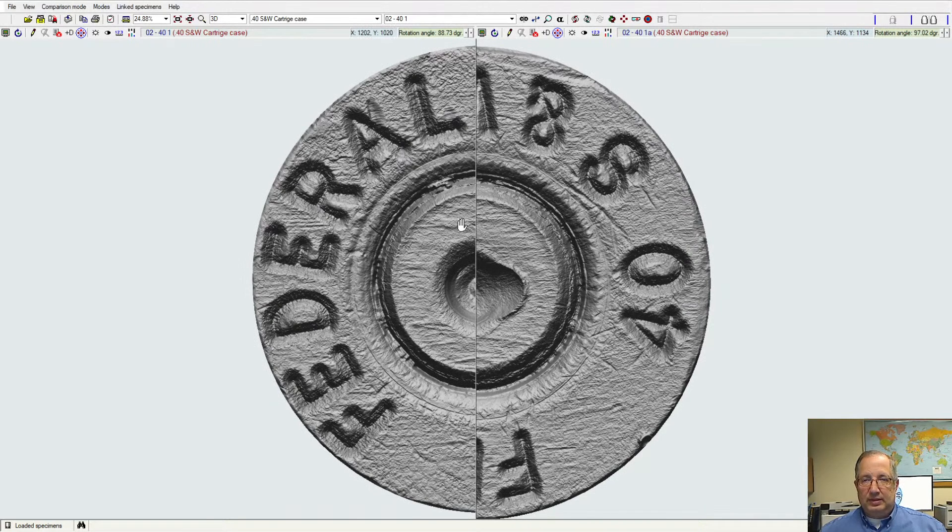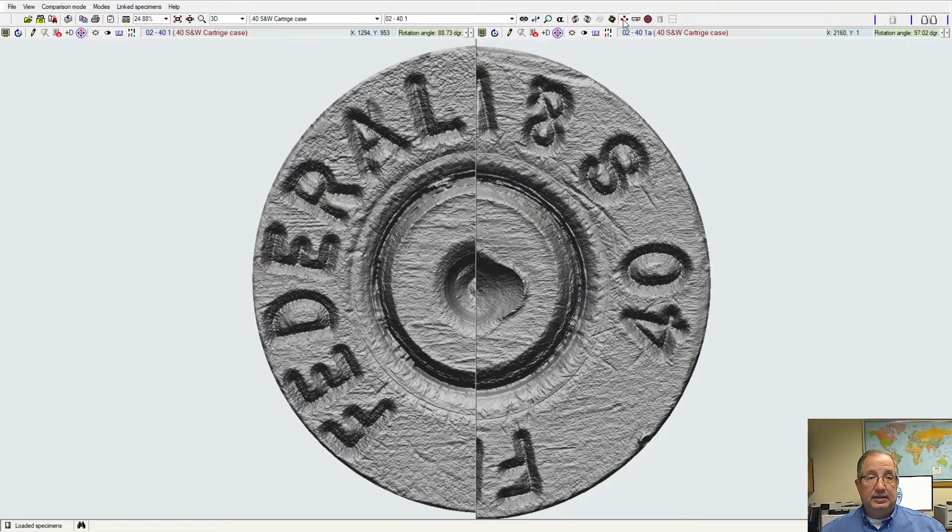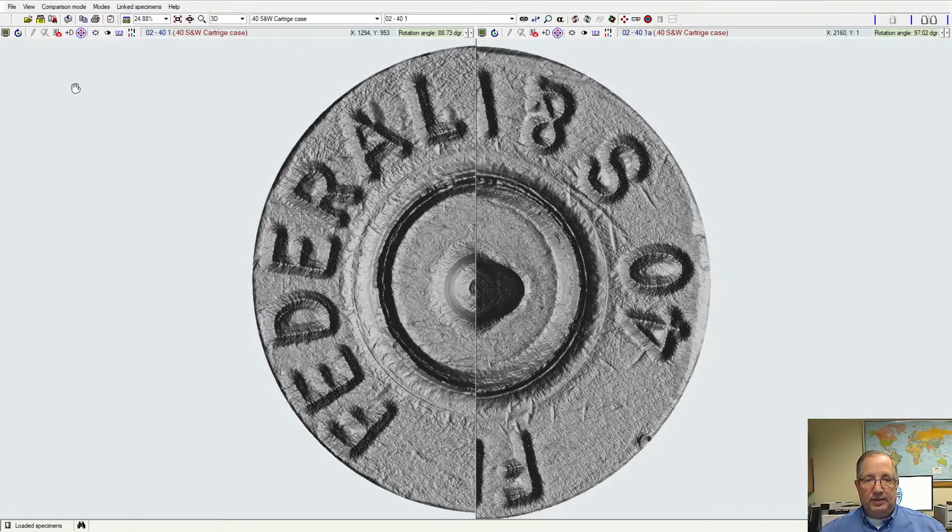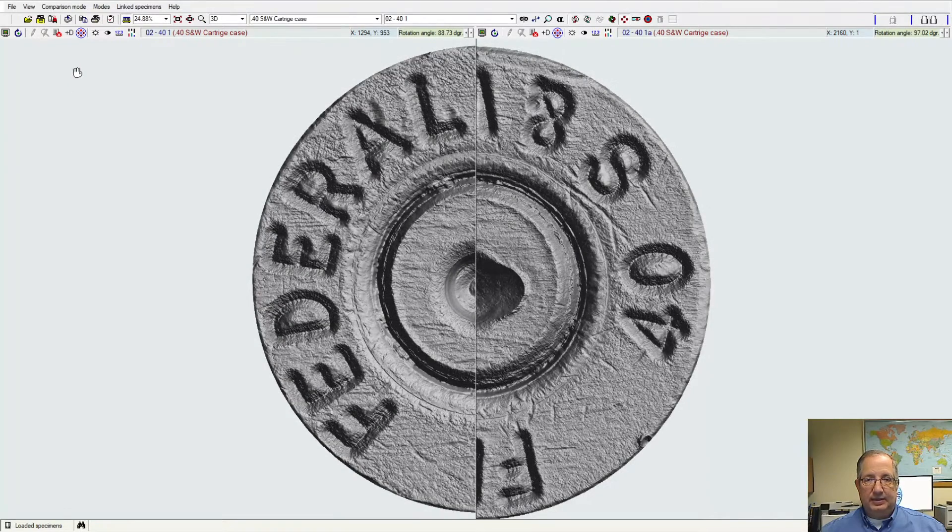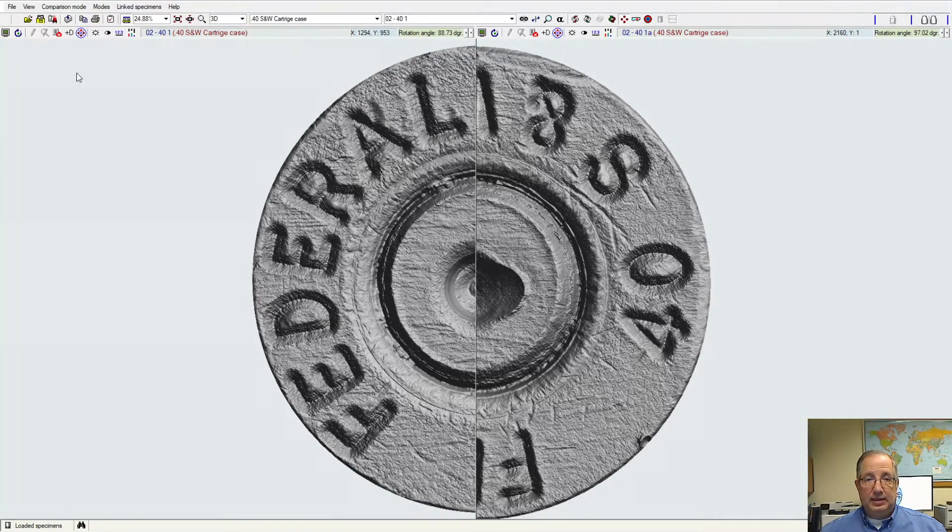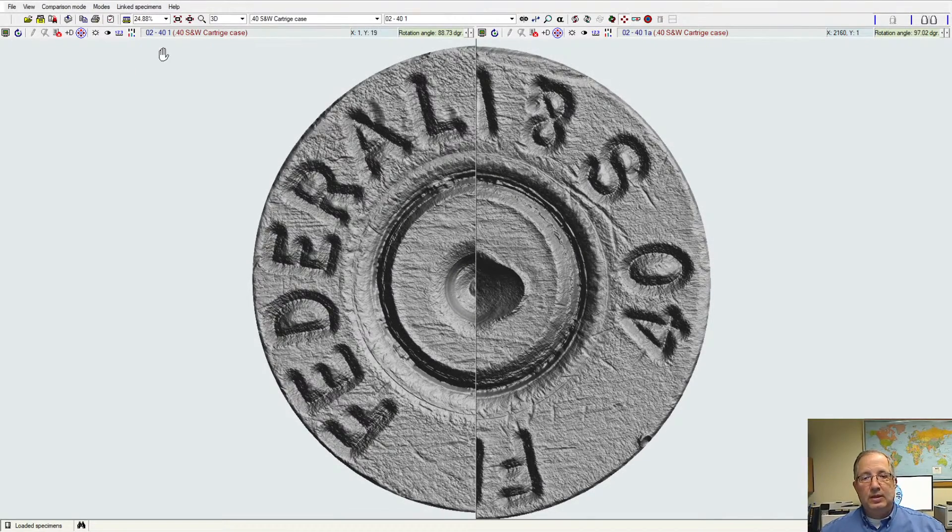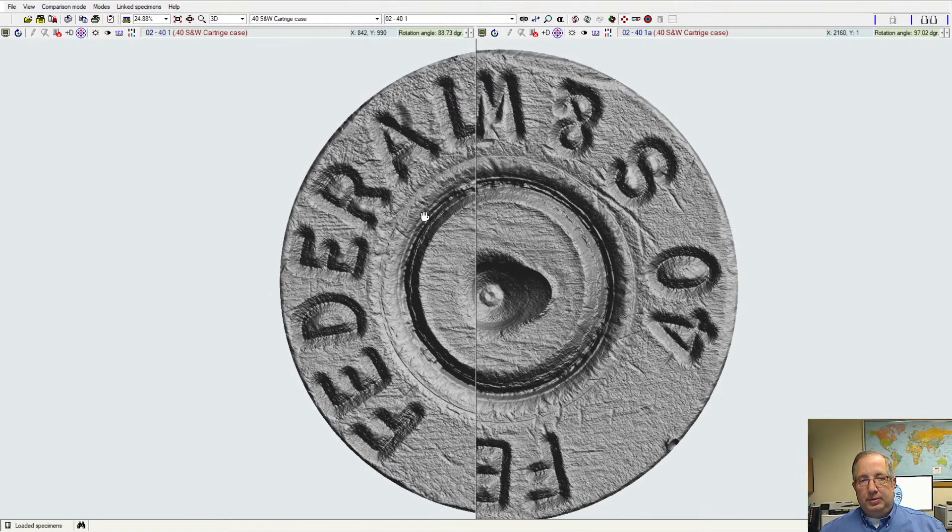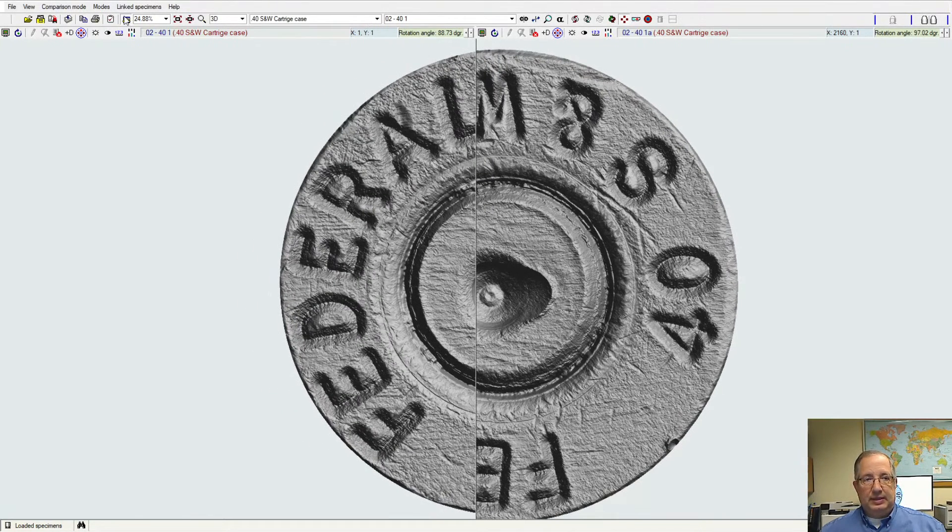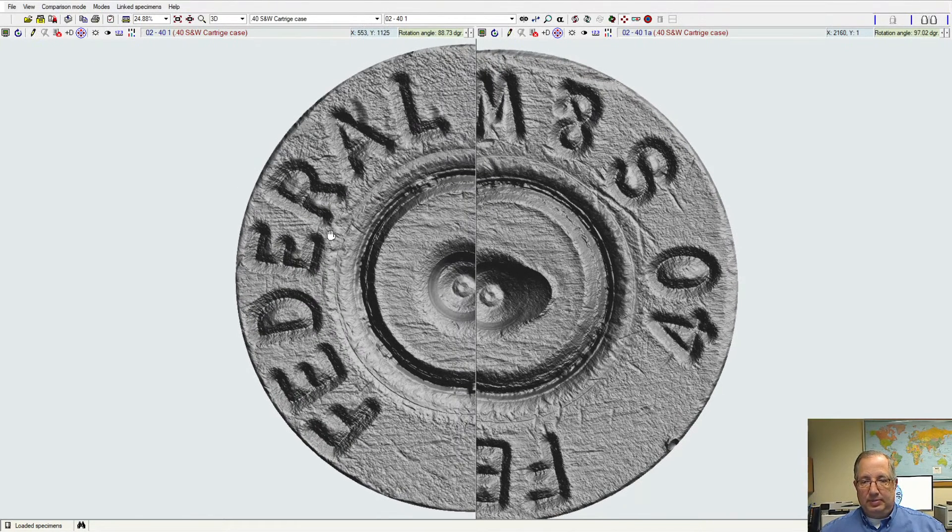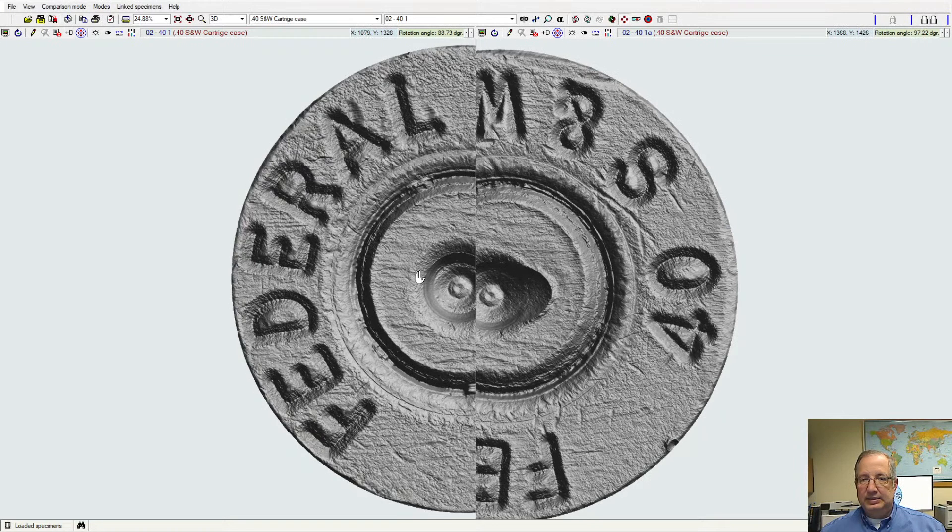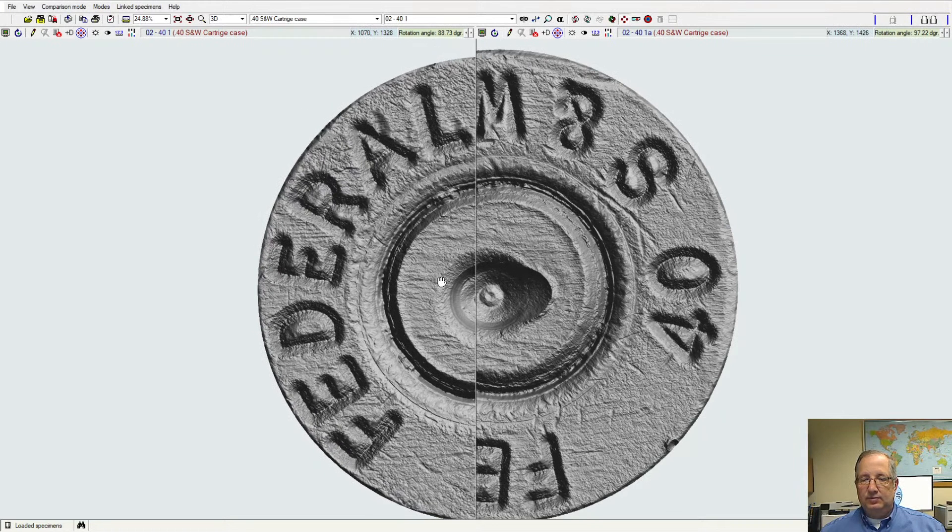I can move the samples in the XY. I can change the lighting simultaneously or synchronously between the samples, or I can move them independently. So if I wanted to move the lighting together, I can do that and lock that in place. I can also manipulate both samples simultaneously or independently, so I can get these aligned just how I want for that virtual comparison microscopy aspect.